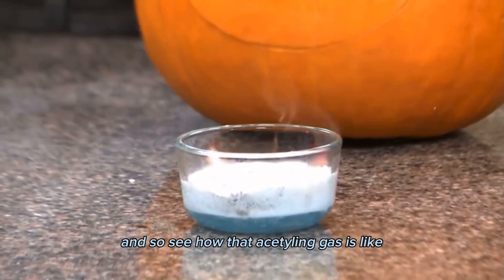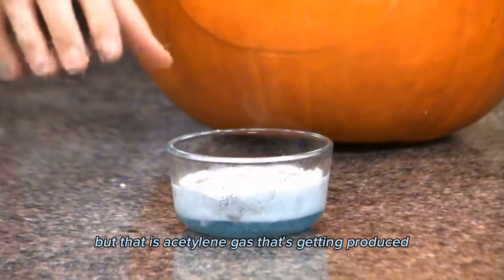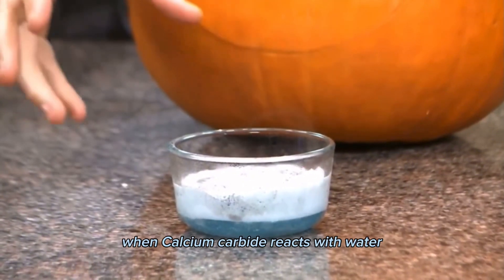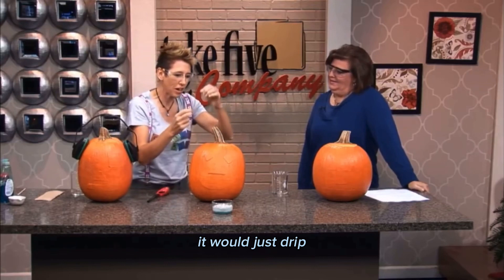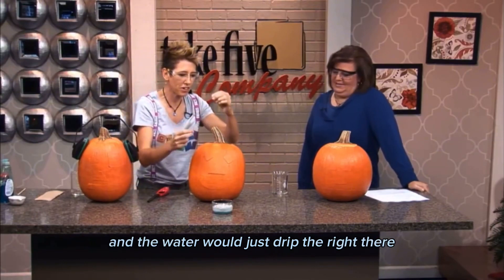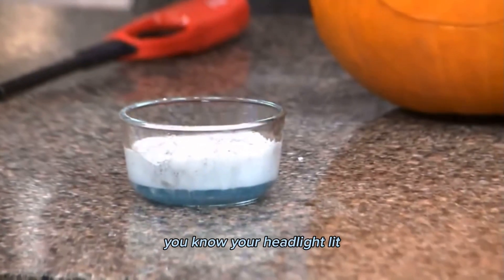See how that acetylene gas — it's like I'm burning bubbles. That is acetylene gas that gets produced when calcium carbide reacts with water. In the headlights of cars, it would just drip, and the water would just drip right there, and it would be a really good reaction for keeping your headlight lit.